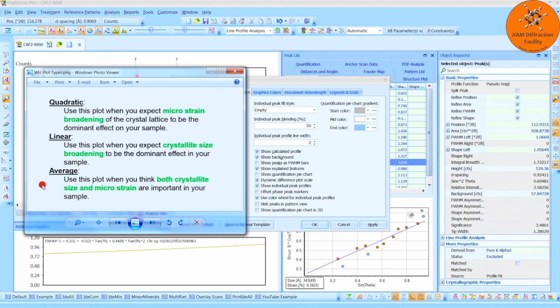If you work through the 3 high-temperature fluorite samples provided by Panalytical, you will see that the linear Williamson Hall plot does not always work the best. The linear type does work best for the raw pattern, but in the case of the 600-degree pattern, the average plot type seems to result in a better agreement with the Rietveld refinement results from the help file. To be honest, I don't know how to tell you for sure when to switch from one type to the next. One reason I like Rietveld refinements is because they don't seem to make you choose between these different types.